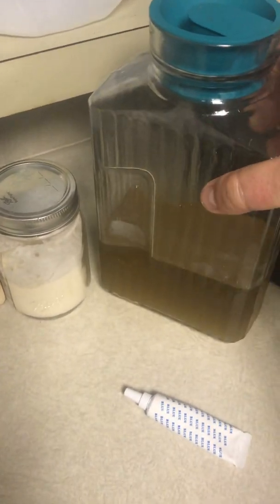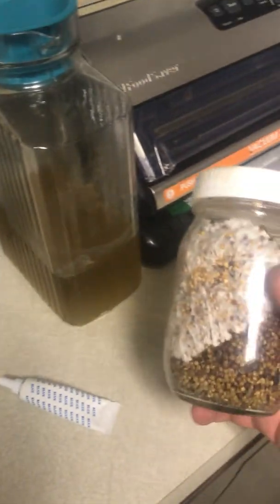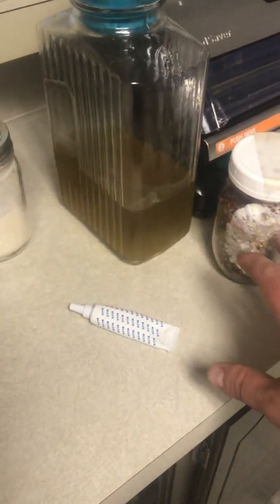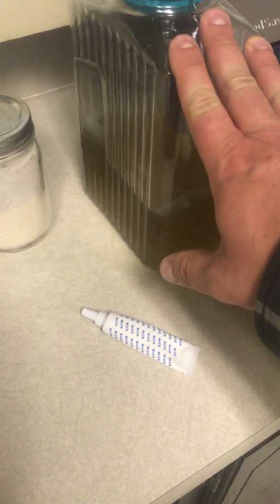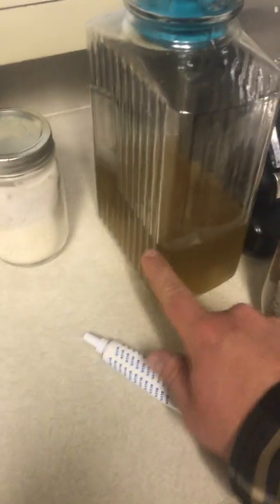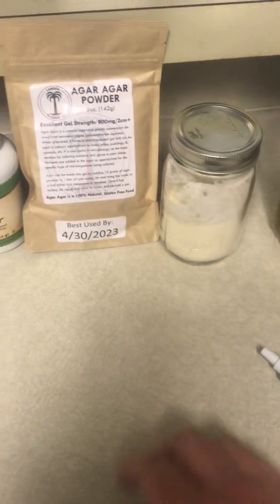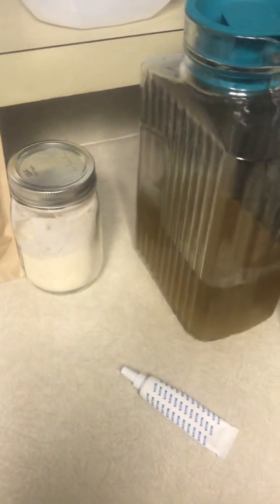Another option is grain water, though this is my least favorite. Instead of using regular water mixed with agar and malt, you can use grain water — the water left over after you hydrate your grains when making grain jars. The reason I don't like it is because I have no idea how many nutrients are in it. If I add five grams of malt extract I know exactly what I have, and I can adjust the recipe next time. With grain water you just don't know how many nutrients you're adding.